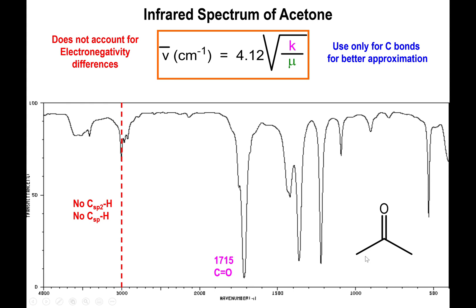For ketones, we do not have any C-H bonds bound to alkene or alkyne carbons. Therefore, you don't see much of anything above 3000. What you observe here is actually water impurities absorbed by acetone, so this is not the purest sample, but it's more or less representative of what you will see in the laboratory.